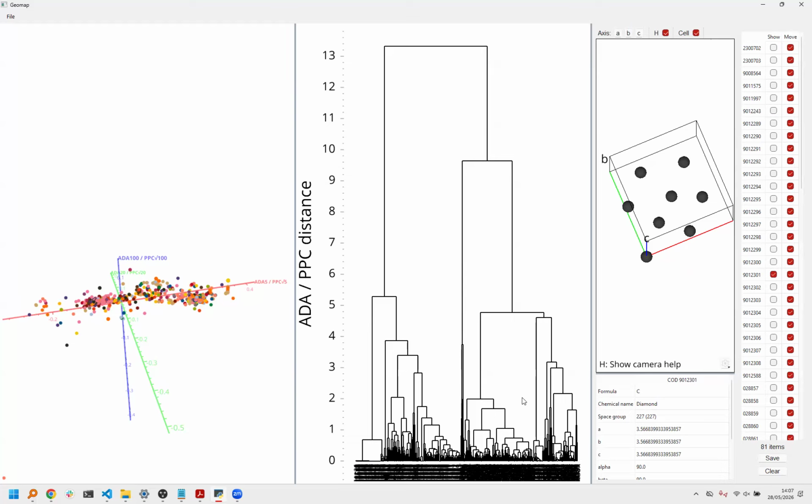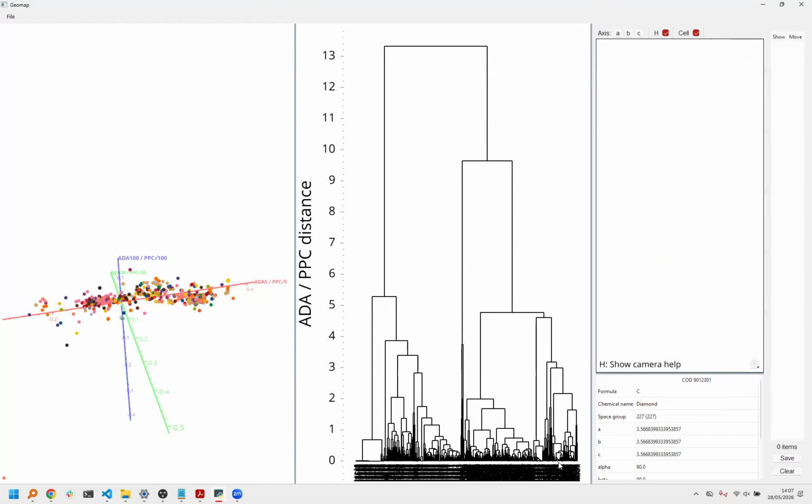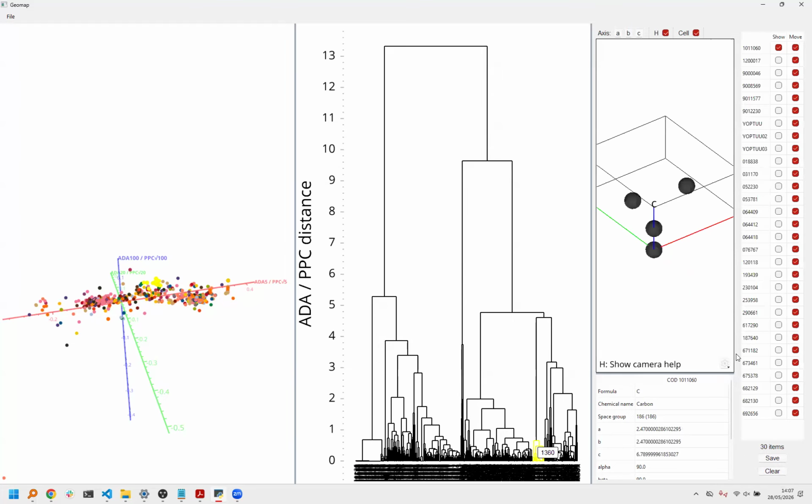And interestingly, I think the second best cluster here is over here. I'm going to guess here that this is dangerous, but if I click on that cluster, we'll get the other most popular, the second most popular, graphite, right? And this is not as flat as this because there's very little variation in the amount that diamond can vary in its measurements. Put it under pressure, but it doesn't do as much. But graphite can change quite considerably depending on various factors. So you have a higher cut-off threshold, but they're still clustered together. And I could scroll through these as well.